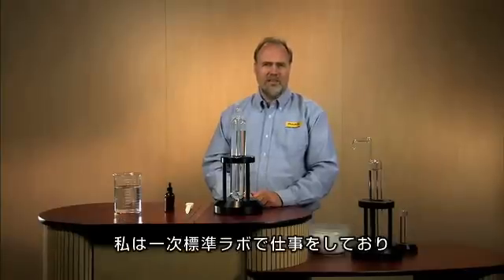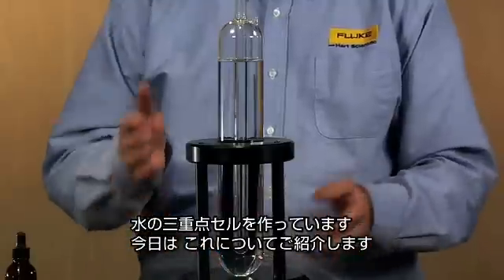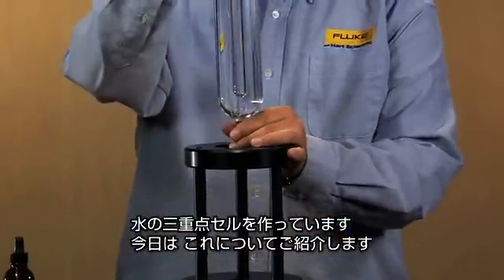Hi, my name's Matt. I'm with Fluke Corporation. We're coming to you today from American Fork, Utah at the Hart Scientific Division of Fluke. I work in the Primary Standards Lab where, among other things, we make the triple point of water cell that I'll be showing you today.